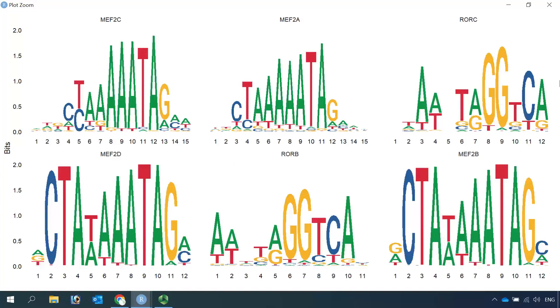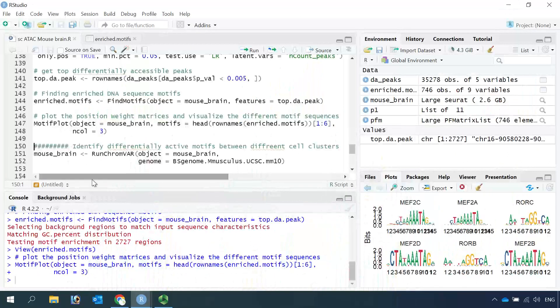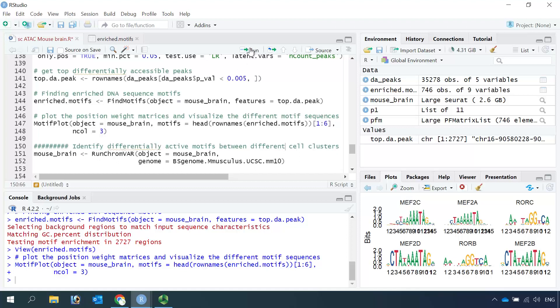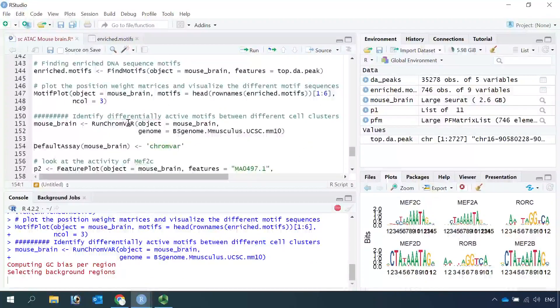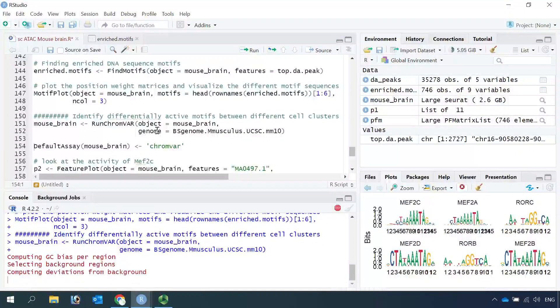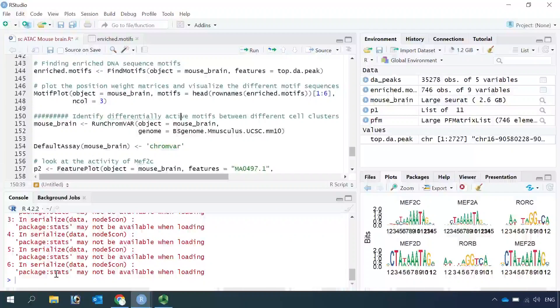Next, I'm going to show you how to perform differential motif analysis between different cell clusters. This analysis provides an alternative method to identify differentially active motifs between different cell clusters. First, we need to run the ChromVAR function. This function calculates a motif activity score for each cell and identifies motifs associated with variability in chromatin accessibility between different cell clusters. The motif activity score allows us to visualize motif activities in each cell cluster using the FeaturePlot function. Now I'll finish the calculation of motif activity scores for each cell.